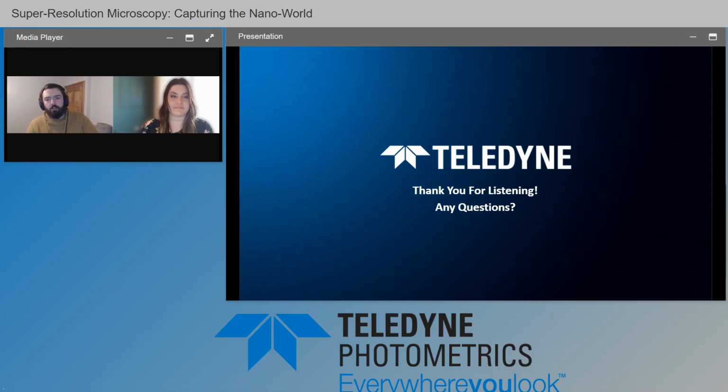One disadvantage, I would say, is that electron microscopy often needs to sputter coat your sample with all sorts of contrast agents, and you typically can't do much live imaging. Whereas with biology, it's really important to be biologically relevant and image live samples and image in 3D to get something that's more realistic of what the sample's real life would be like, as opposed to a 2D slice where you've quite harshly treated the sample.